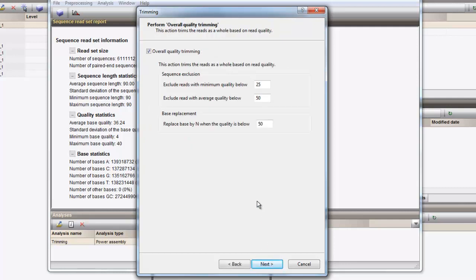On the next page, the overall quality trimming parameters, as deducted from the quality assessment graphs, can be defined. For this dataset, we alter the minimum quality to exclude reads to 10, the average quality to 30, and the quality for base replacements to 10.